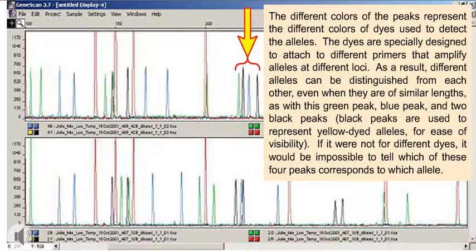Black peaks are used to represent yellow dyed alleles for ease of visibility. If it were not for different dyes, it would be impossible to tell which of these four peaks corresponds to which allele.